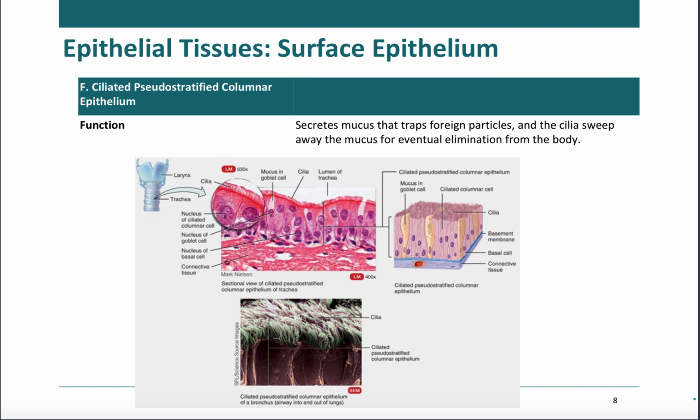Okay, so this is pseudostratified columnar. Now, you've got a lot of features of columnar, but you'll notice there are random tiny cell-looking things here, which makes you almost think it's stratified, but it's not. The reason is, generally speaking, when you see stratified, there are really clear layers. This pseudostratified one has sections where it's one layer and sections where it's two layers, and it's all over the place. That's how you can tell the cells are flopping over and creating weird pockets and weird shapes around each other, okay? So that's why we call this pseudostratified.